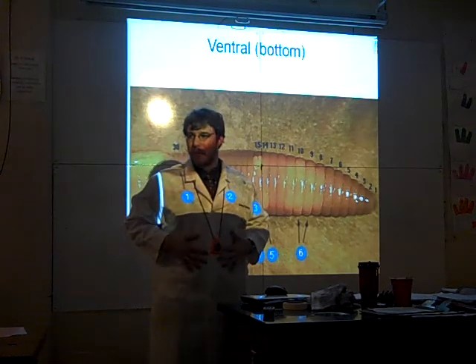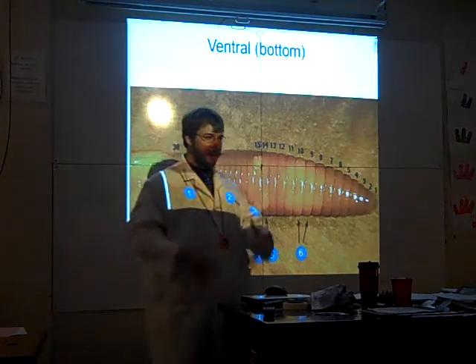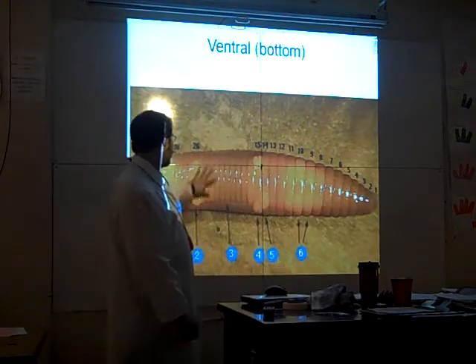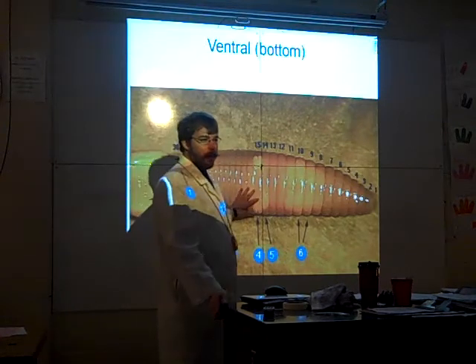Joey, are you rubbing your belly? Right now you're rubbing your whole ventral side. This is your ventral side. The ventral side of the worm is a lot thinner. You can actually see some of its sex organs sticking out, right around segment 15 through 26. These are sex organs.